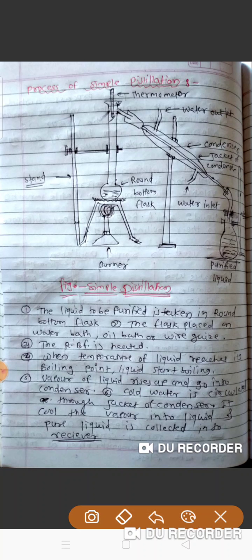The process in which a liquid is first converted into its vapors and then the vapor is condensed back into liquid is called simple distillation. Simple distillation is used to separate volatile liquids from non-volatile impurities, and liquids which have a sufficient difference in their boiling points. We have also seen the experimental setup figure and the apparatus used for simple distillation.